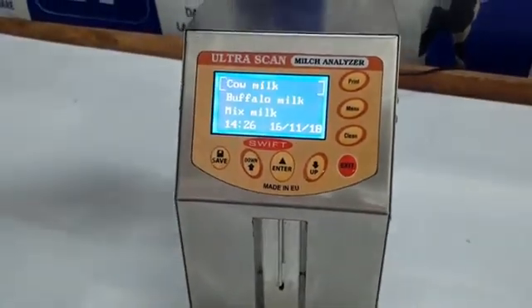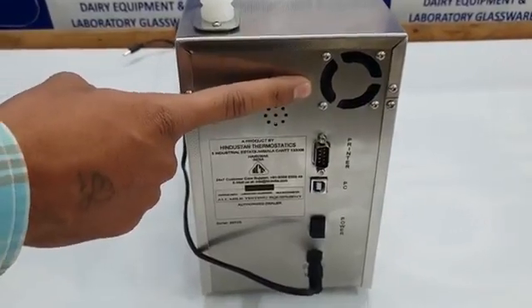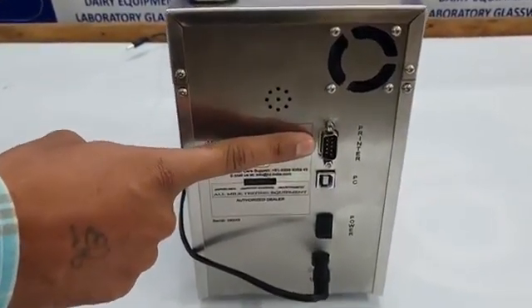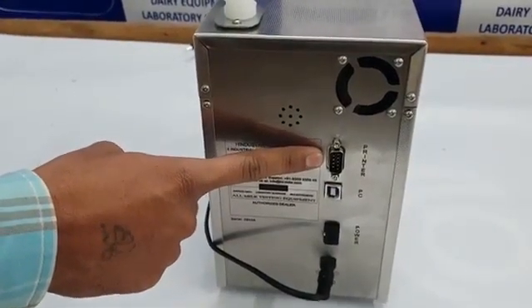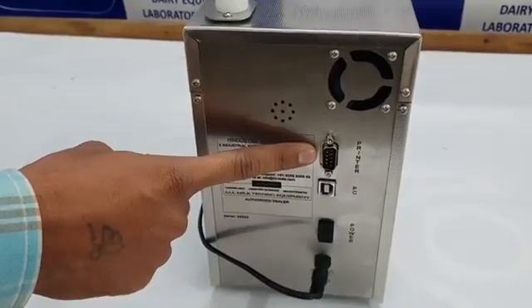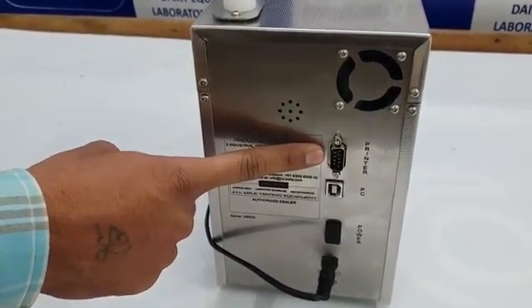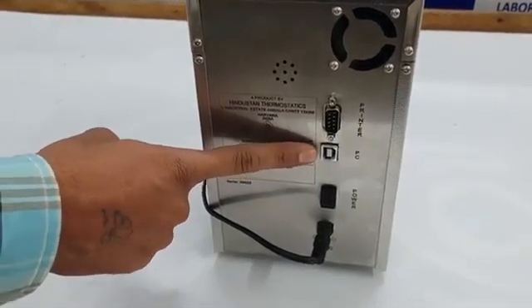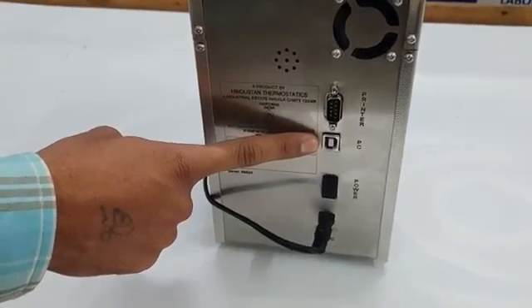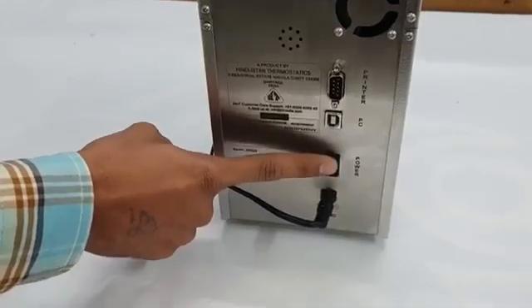On the back panel there is an inbuilt fan for high temperature working conditions. There is one serial port for data processing unit connectivity and direct printer connectivity — allowing you to connect any serial port printer for result printout without a separate data processing unit. There is also a USB interface for connecting to a computer for data capturing, a power on/off button, and a DC power input.